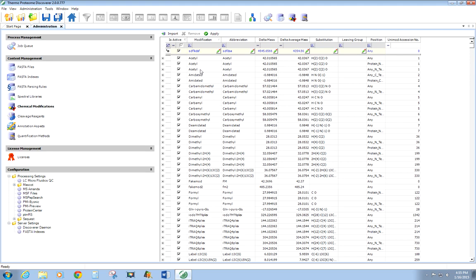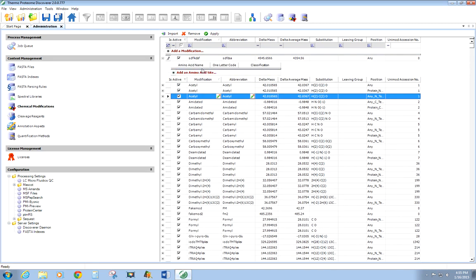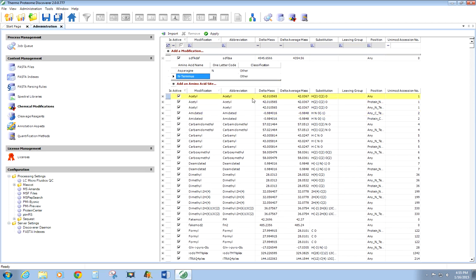Now, I'm not quite done yet. I need to click somewhere else on this Unimod database. So this is imported, and now I need to tell it what amino acids this exists on. So say my fake mod here will modify asparagines and N-termini. And just add that here. Hit the apply button, and now it is searchable through any of the fully ported nodes in Proteome Discoverer.